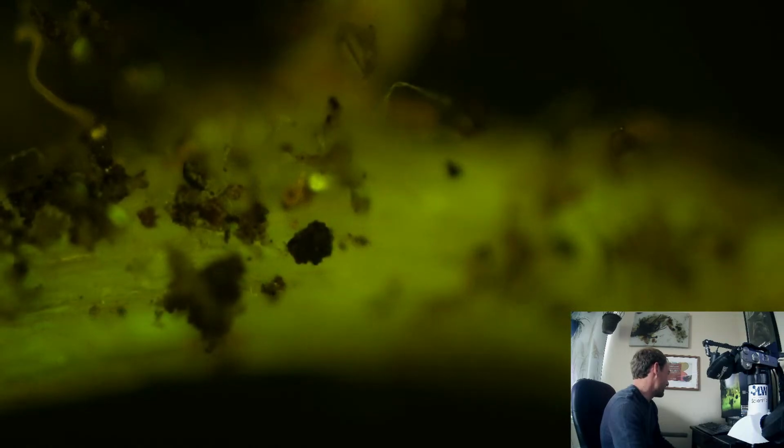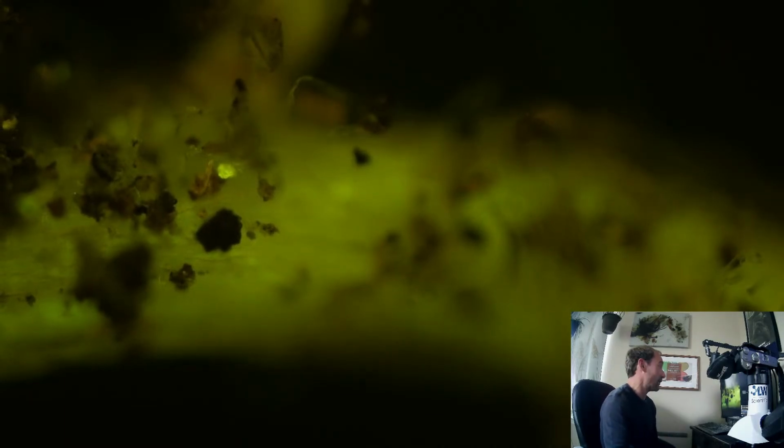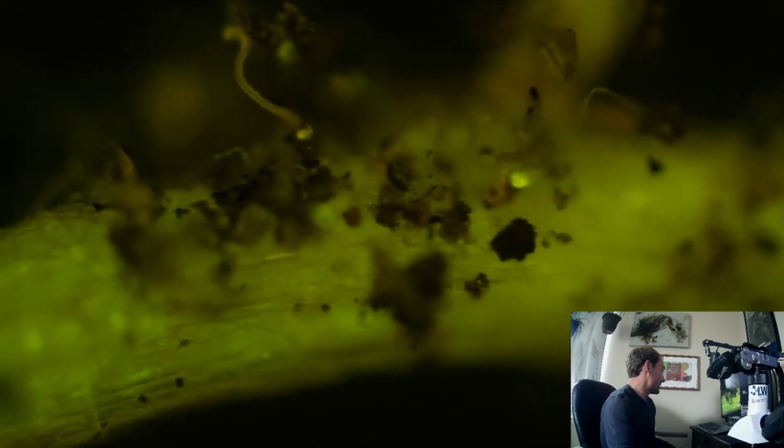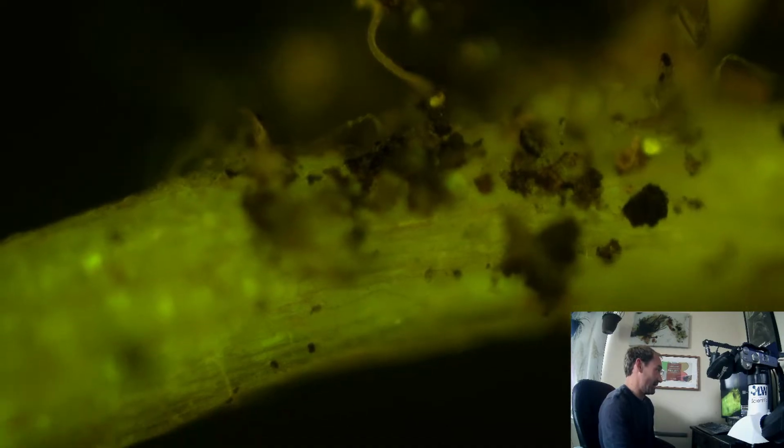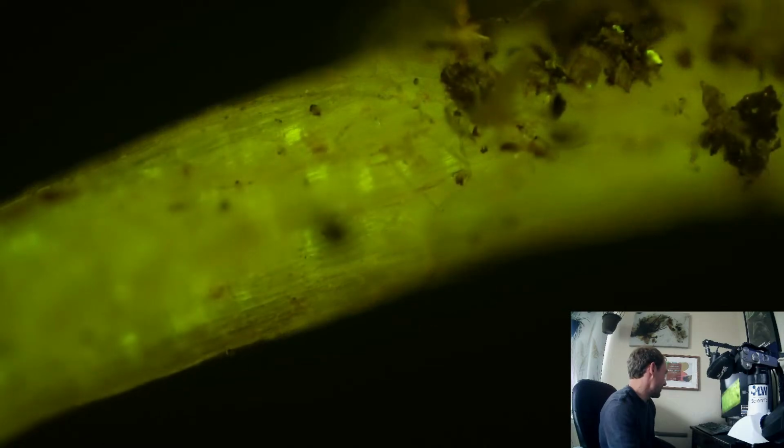It makes it very difficult. But like right there in the middle, that bright green glowing thing is probably a little chunk of phosphorus. We figured out with this particular cyan blue wavelength that the epi-fluorescence works out really well. Very narrow wavelengths that are very specific make phosphorus glow. So look how bright this dandelion root is glowing over here.